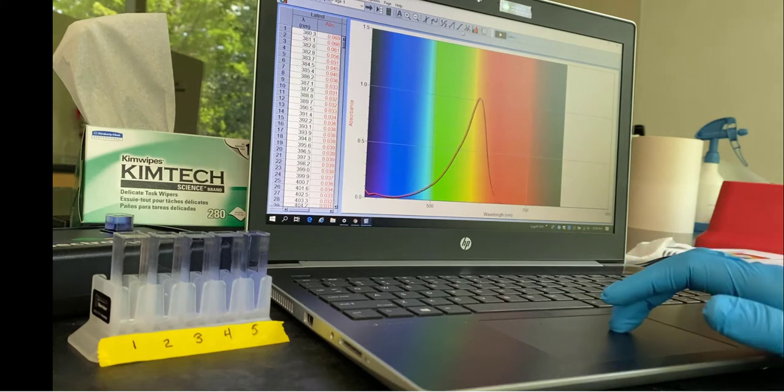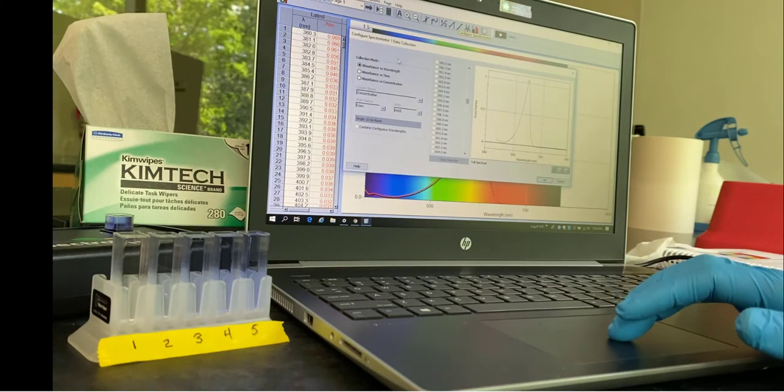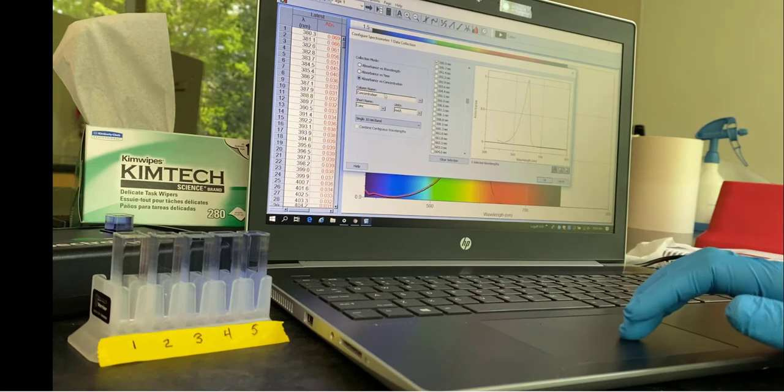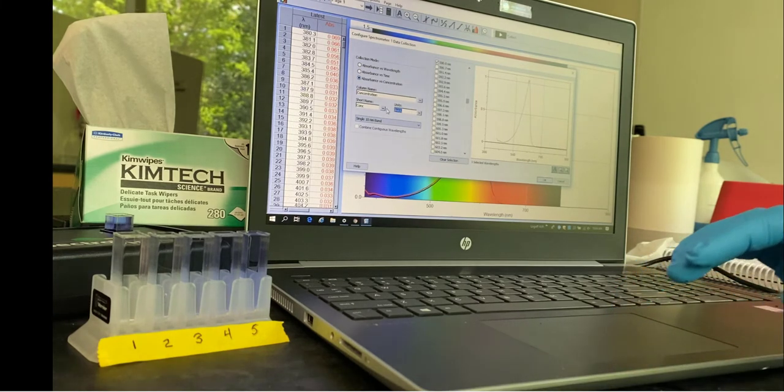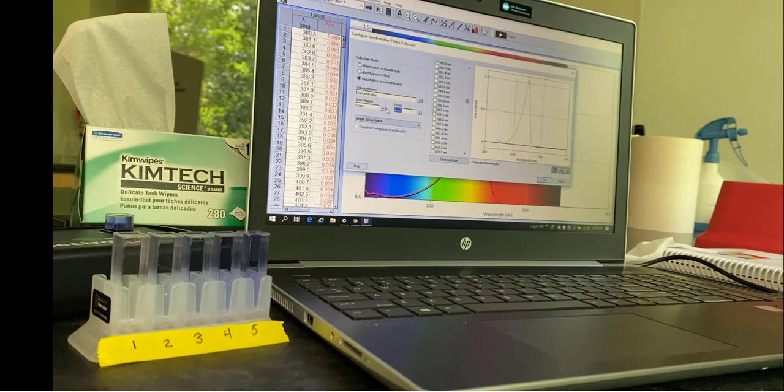What we're doing is we're picking the optimal wavelength for our experiment and the computer does this automatically. And now I'm telling the computer for the rest of the experiment to generate a graph that's going to be absorption on the y-axis and concentration on the x-axis at that specific wavelength that is optimal for bromophenol blue.